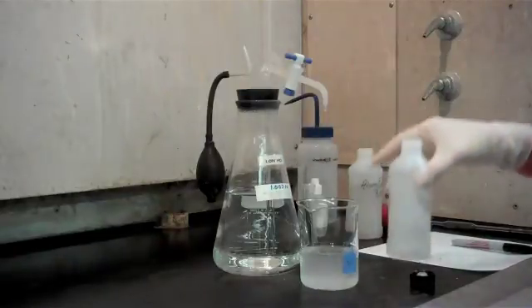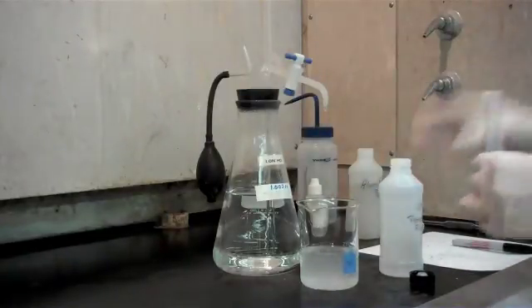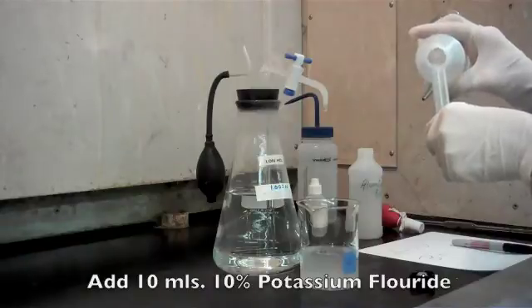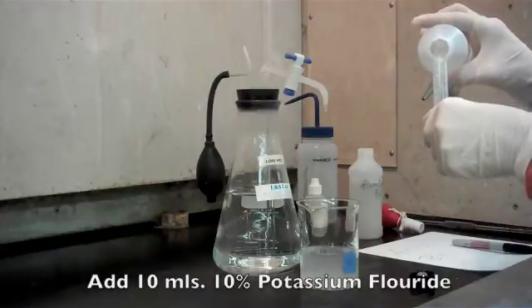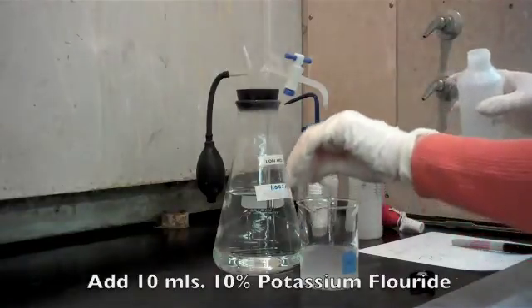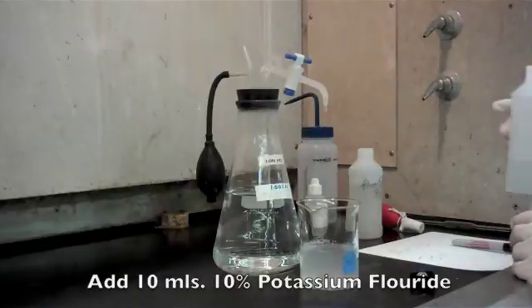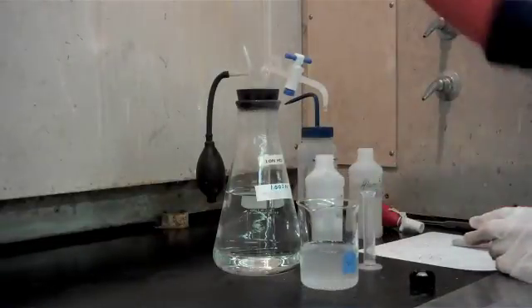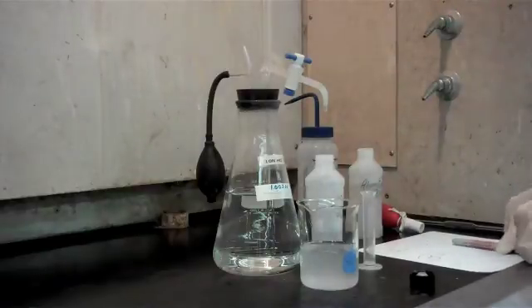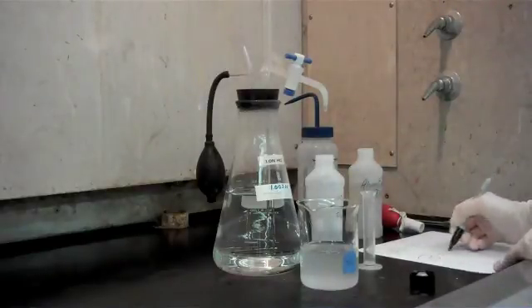And what we're going to do to make sure that we've gotten completely to the endpoint is add another 10 mils of the potassium fluoride, just to make sure the solution does not return to pink, which it does not. So we have our second endpoint, and it's 1.5 mils of the one normal hydrochloric acid.